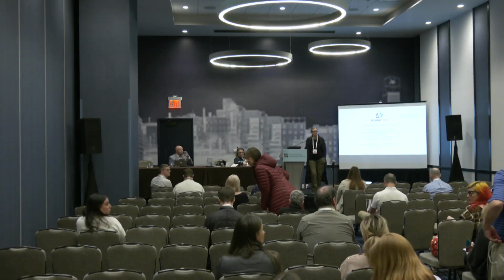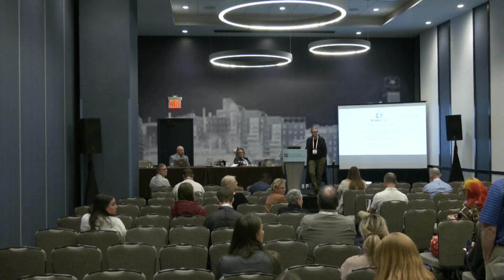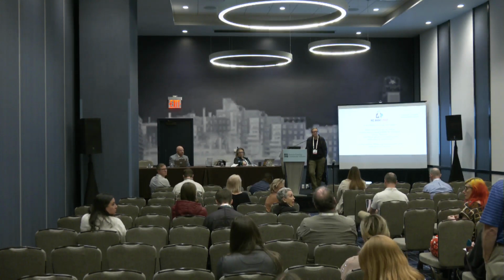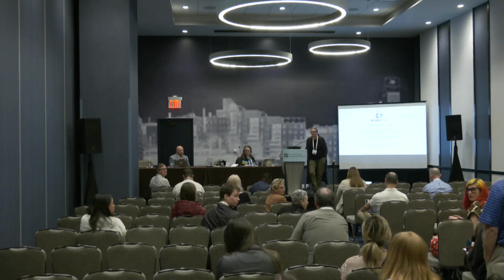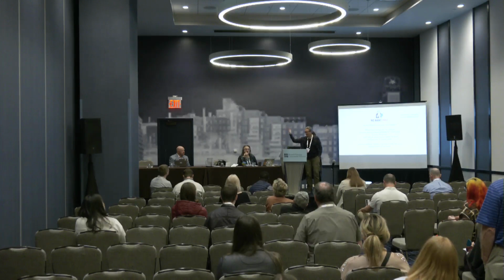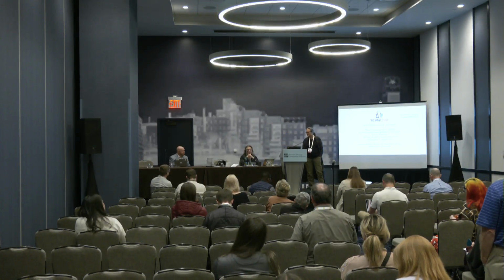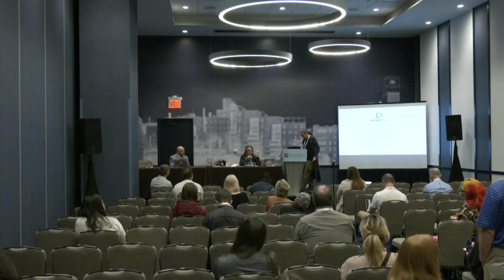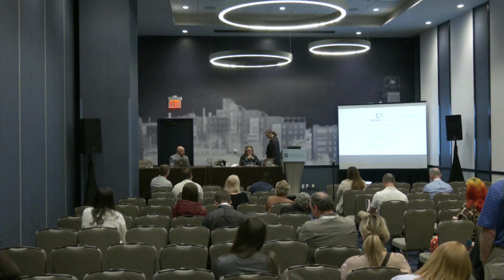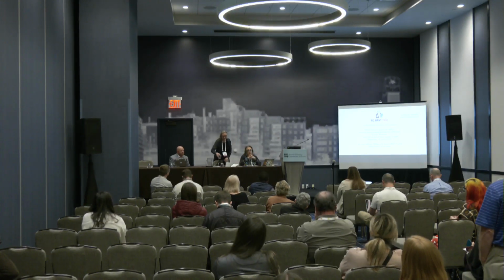A question about instrument RRID. Should those not be instrument-specific serial number rather than a generic term? So this is the project that we have done to extend the capability of the core marketplace for instruments, with Anita, and it has been exactly that, at least for microscopy.